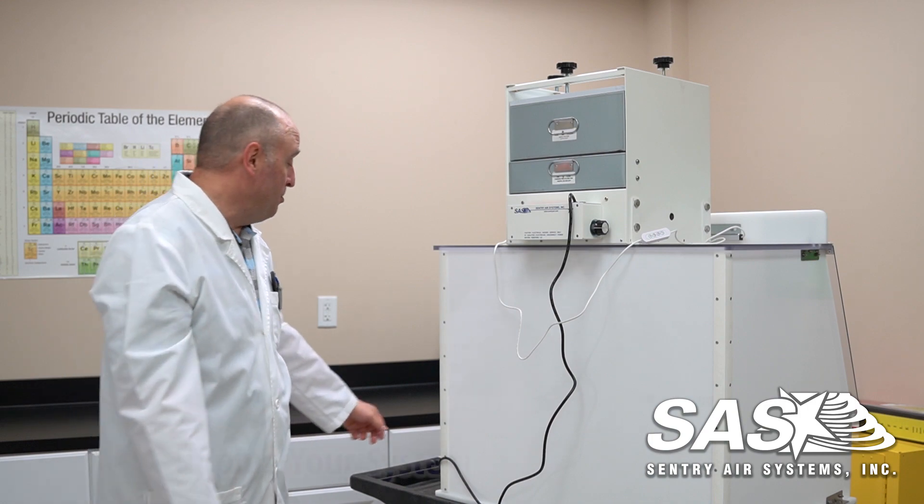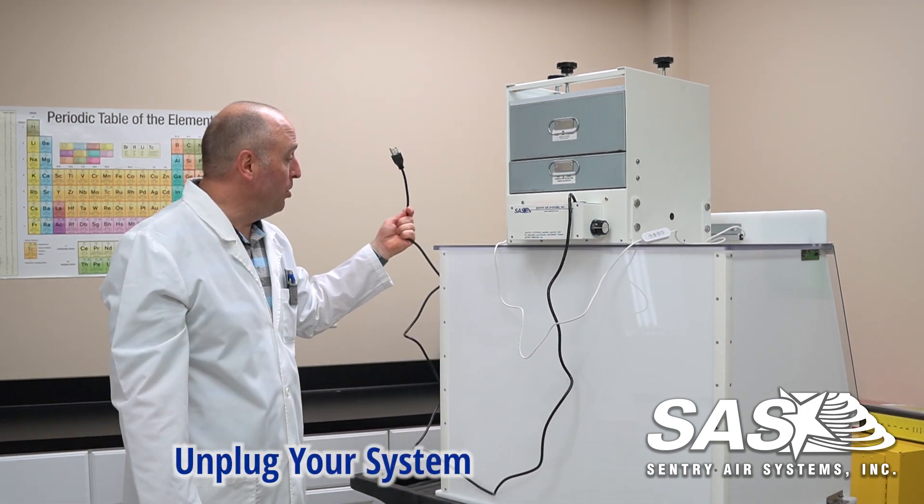Hello, I'm Seth and here at Central Air Systems today we're going to go over how we change out our filters. First thing you want to do for safety is make sure that you have the hood and your equipment unplugged.